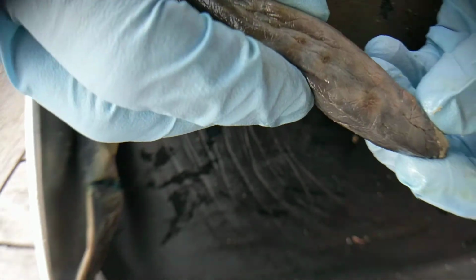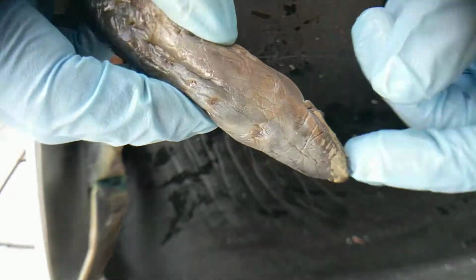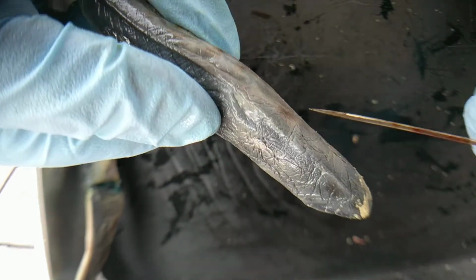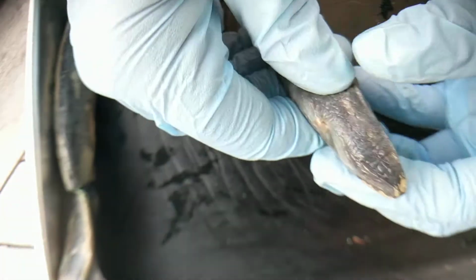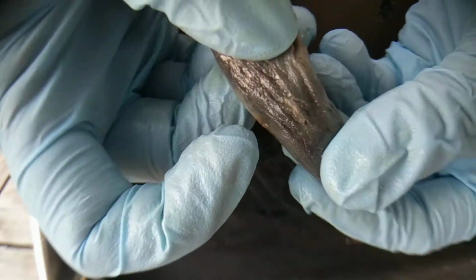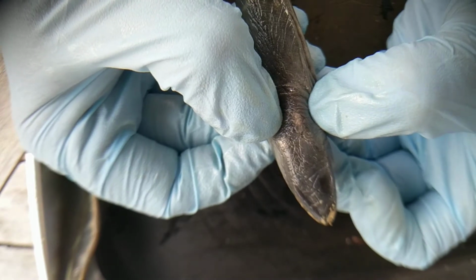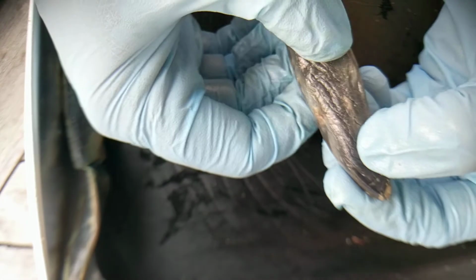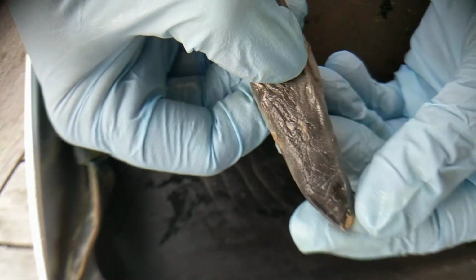So again, this is the head of the lamprey, right? And the mouth opening is here. These are the eyes. And then I'm just rotating to the back here. So this is the dorsal side. Kind of flattening it. All right, so you see that a little bit lighter spot in the middle is called the pineal gland, or the pineal organ. And that is a light sensing organ on the lamprey.